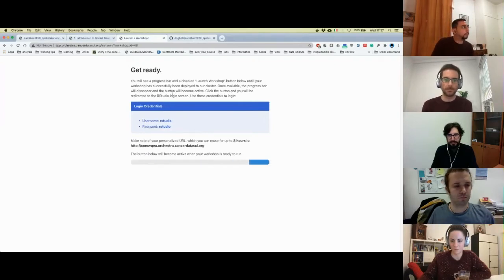Yeah, I can. My part is an introduction. Right, so while RStudio loads, Dario, you can go on.